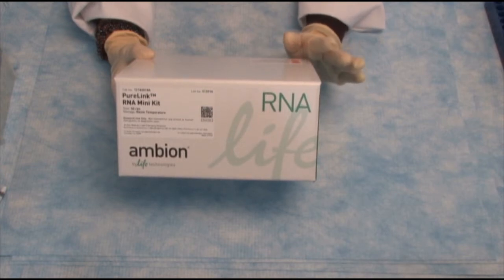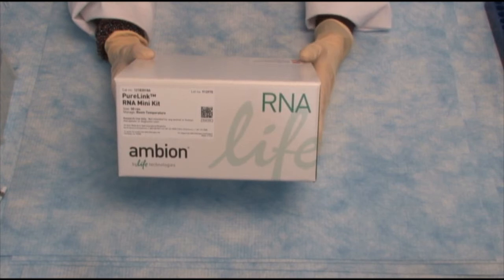So essentially, it just requires pipetting and centrifugation steps, and in 20 minutes, you will have isolated your RNA. Let's see how it works.